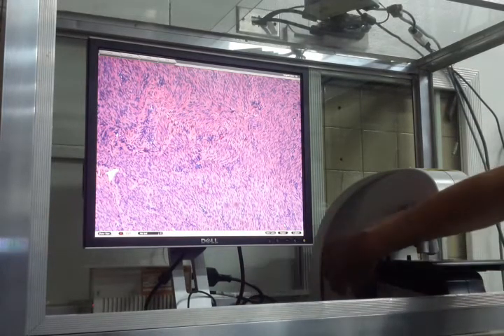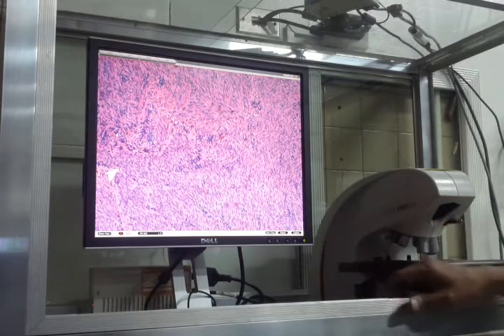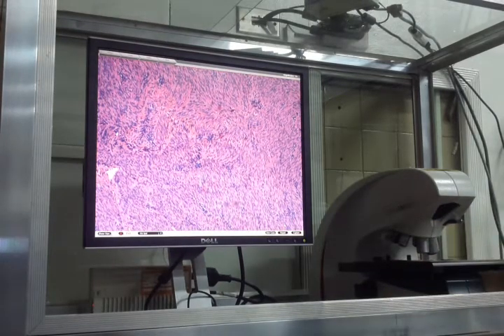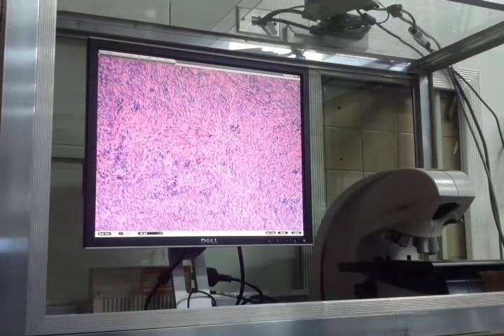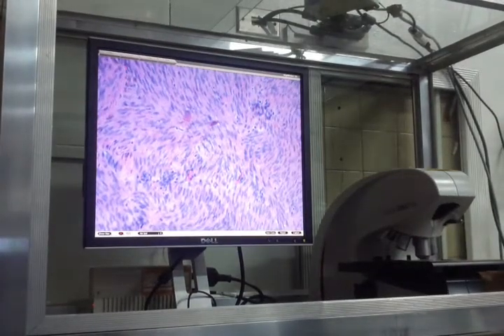Okay, this is a neoplasm coming from the uterus. It's a nodular, easily shelled out neoplasm coming from the uterus, well-defined borders. And what do you see? It's the same as the histology of the normal myometrium, correct?